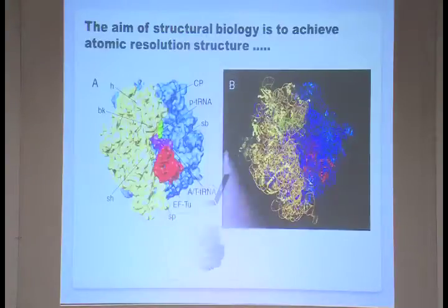And still, as structural biologists, we want to see structure as atomic models, not this topological thing. Without this atomic structure, we used to call this the beak, the spar, the shoulder, like that. So we want to see this map in some atomic description.